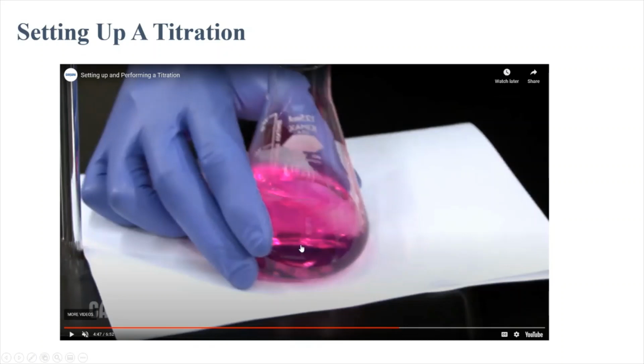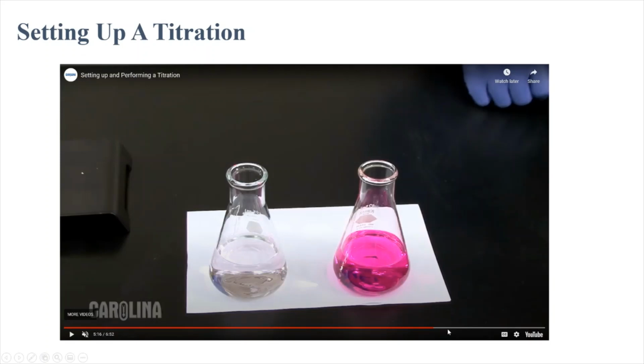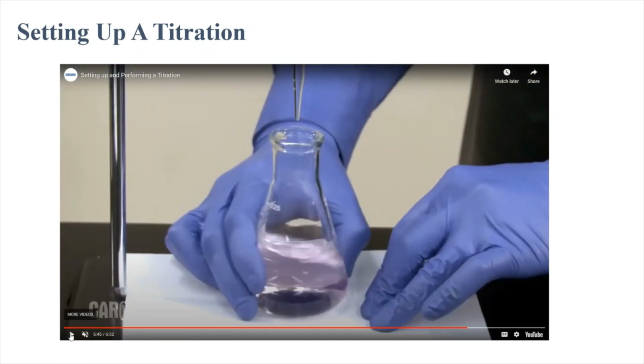And then when I get to 5 or 6, I can just open the stopcock up, go right to 5 or 6 mL added, and then I can start to slow it down and add smaller portions until I get very close. And the way you know it's very close is when you add some and it takes a long time to go away. So let's take a look at what he's talking about at that point.